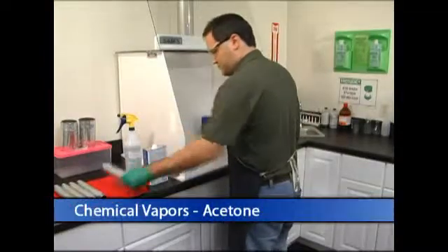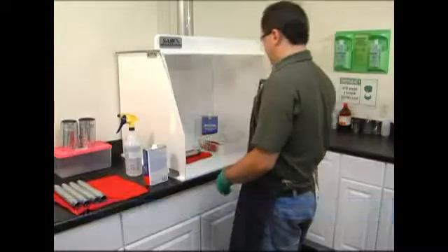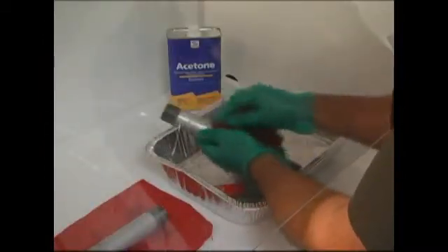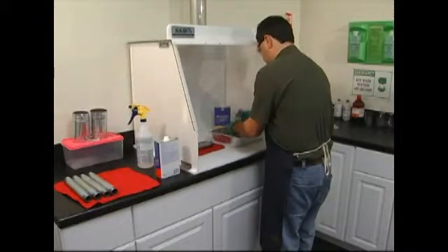These bench top hoods feature unique hinged folding side panels, a high density polyethylene base, a clear polycarbonate top, and a hinged sloping front lid. Sentry Air's exhaust hoods are extremely compact and lightweight and are useful for a variety of applications.